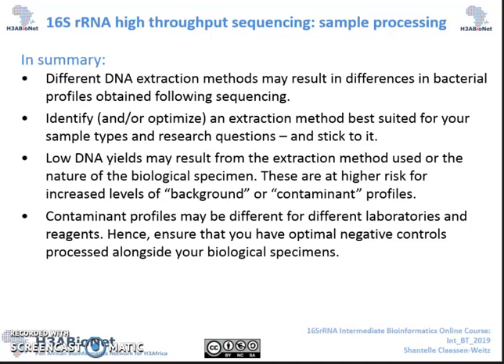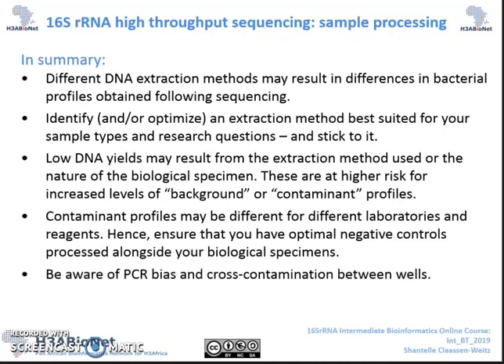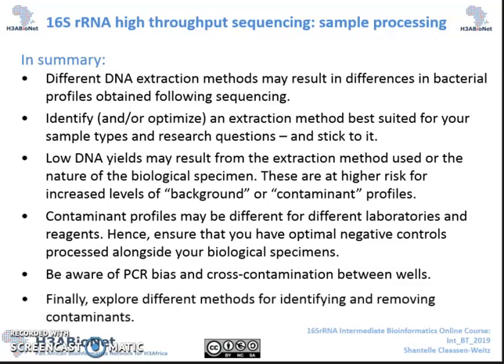Hence, ensure that you have optimal negative controls processed alongside your biological specimens. Be aware of PCR bias and cross-contamination between wells. And finally, explore different methods for identifying and removing contaminants from your experiment.